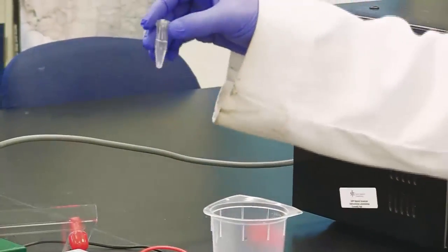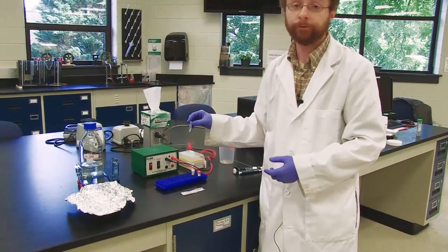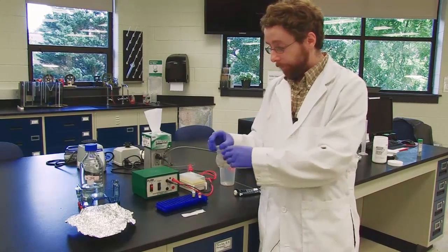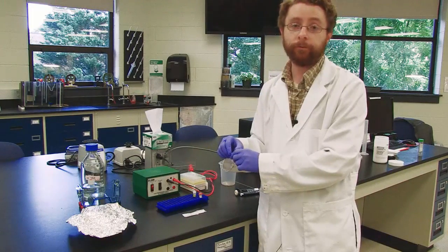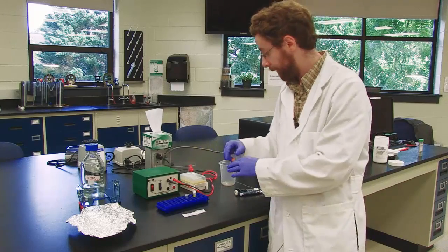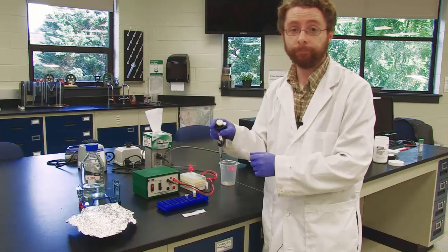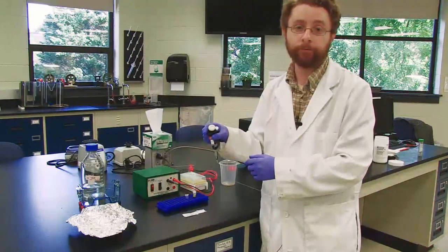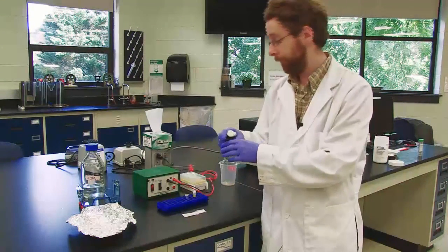So here I have a sample of DNA, and I would like to see it or visualize it using agarose gel electrophoresis. In order for this DNA to go into the gel, I have to add what's known as the loading dye. So I have here some DNA loading dye, and this is 5 times concentrated. So if I want to load 20 microliters of DNA, then I need to use 4 microliters of my loading dye.